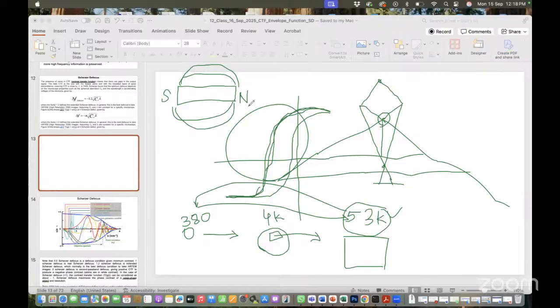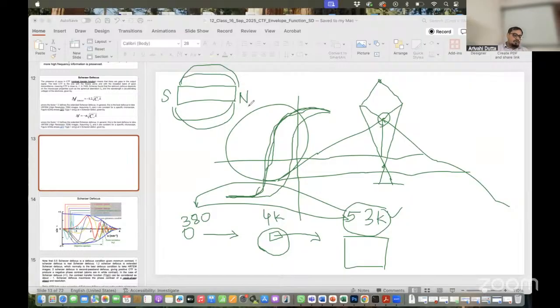Okay, so the microscope cannot monitor the actual field present in the electromagnet. At least whatever microscope we are using for biological work or Cryo-EM, we cannot, but some modern microscope maybe, that I am not very sure.